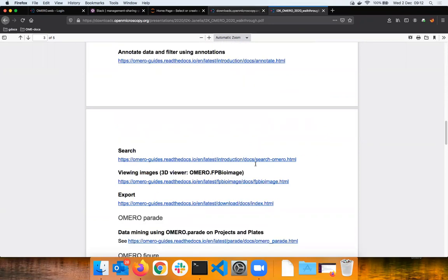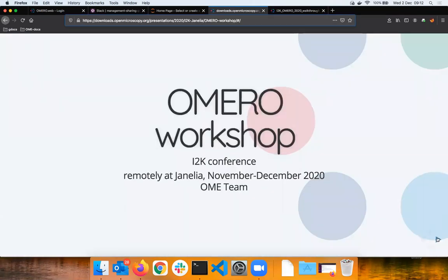Right, so without further ado, good morning again. In the I2K conference, the OMERO workshop. My name is Peter. You can see my full name in the participants list of this Zoom. It's hard to pronounce and not so interesting. And this is my colleague Jean-Marie Bourrel. We are members of the OME team.